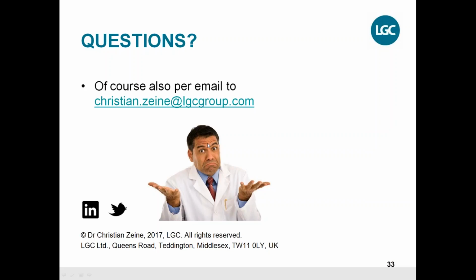Yes, thank you for that question. When we have set up the reference standard and we have no data at all for these materials, we give an initial validity of 1 year for that material, and in parallel we look at the stability of that material in very close intervals. And later we also extend that interval period. In the beginning it is 6 months, then 1 year, then 2 years, 3 years, and based on that we set up the expiration date.